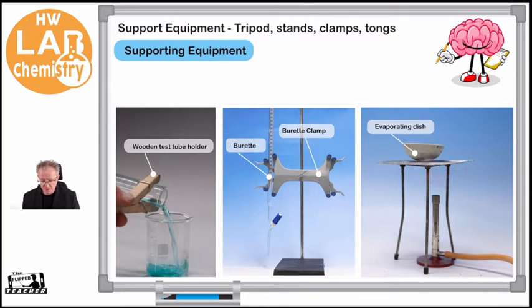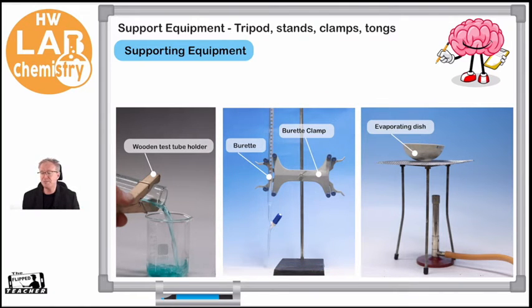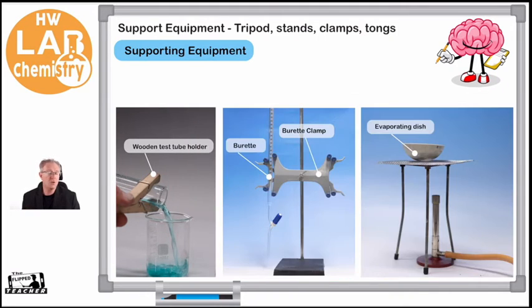Here we can see another experiment — looking at acids, bases, and titration in more advanced chemistry. We have our retort stand, and here we have a burette. The burette allows us to add volumes of liquid to another container very accurately, so we need to hold it steady so we can add the volume and read off it. We have another type of clamp here called a burette clamp. Then we have a test tube holder, which allows us to hold the test tube for many different functions — here I'm using it while heating liquid in a test tube.